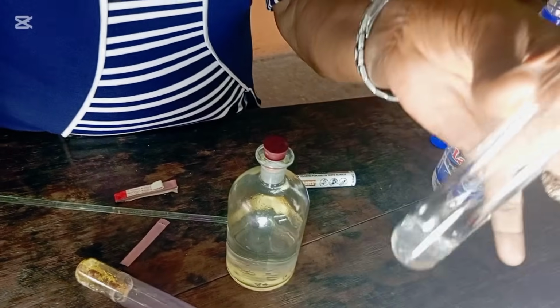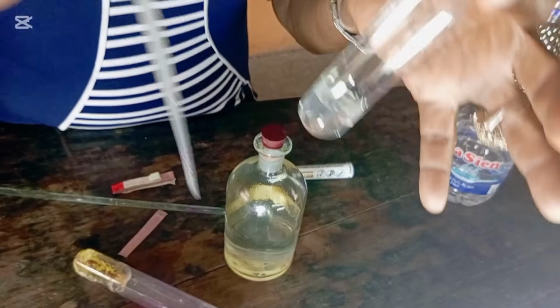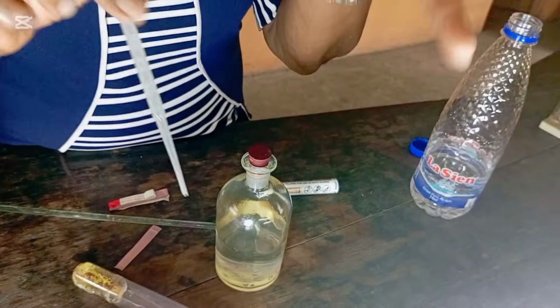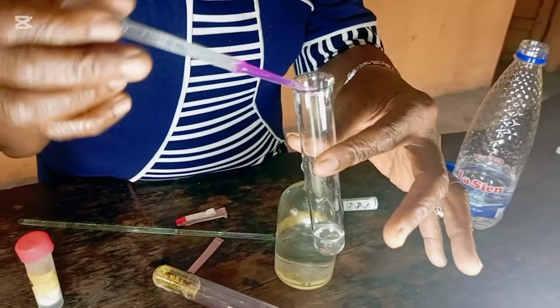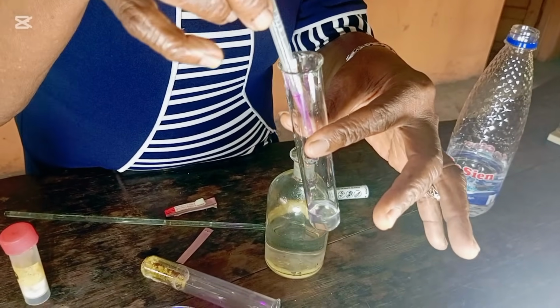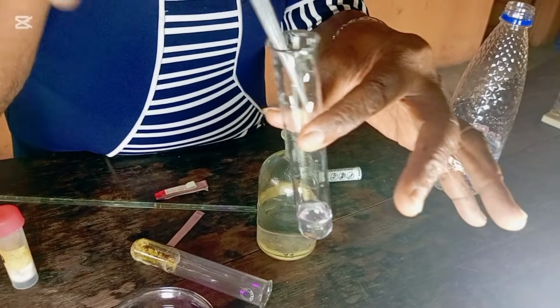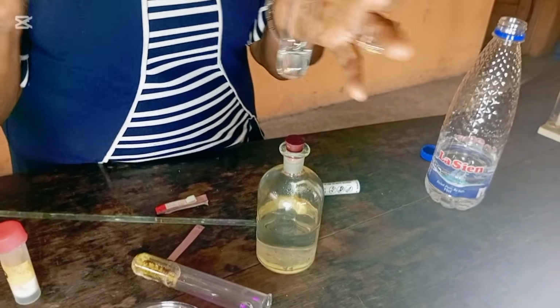Decolorized. The color is disappearing. What does that tell you? That this sample D is a reducing agent. Let me try it again. You can see that the more you add, the more the purple color is disappearing. That's interesting. I hope you can see it.